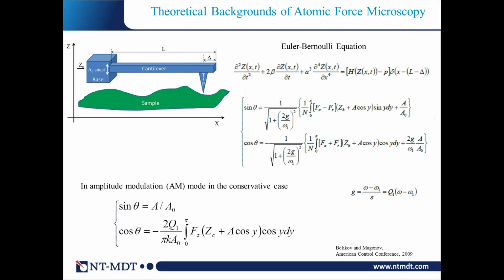And the result is that slide, which shows the main issues. First of all, we consider the motion of the cantilever in atomic force microscopy using the Euler-Bernoulli equation. There are a lot of different symbols here, but the main point is that we consider this really as a true three-dimensional structure, without any approximation which simplifies the problem. Plus, this is the equation of motion of the oscillating problem, because this is one of the main modes where the cantilever is brought into oscillation by the piezo drive.